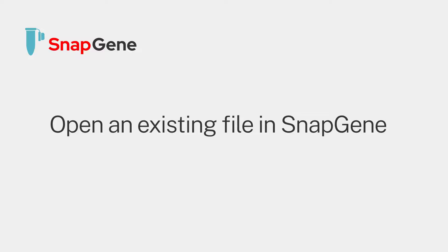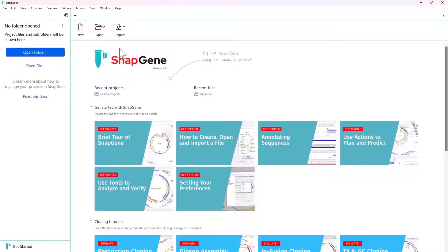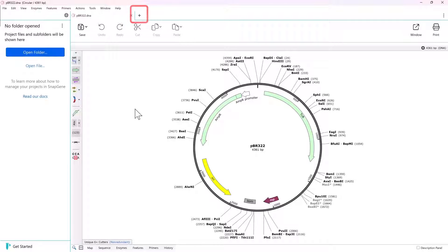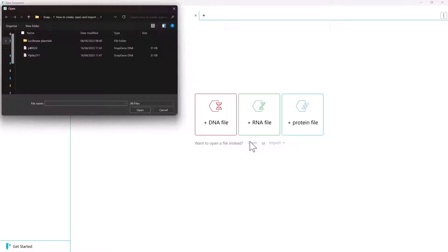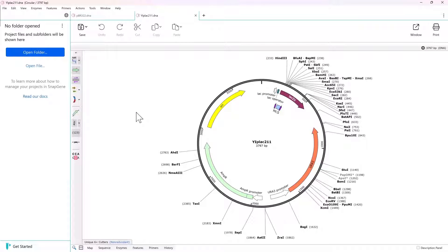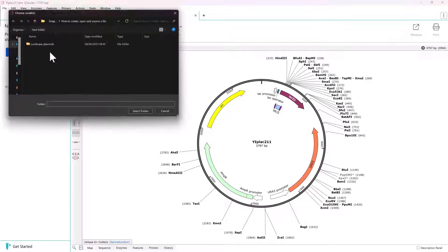You can open existing files from the launch window, or by clicking the plus button at the top of the screen. If you have a folder containing multiple sequences, you can also open that project folder.